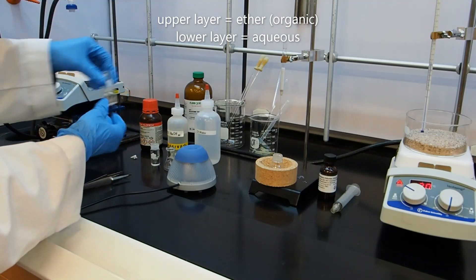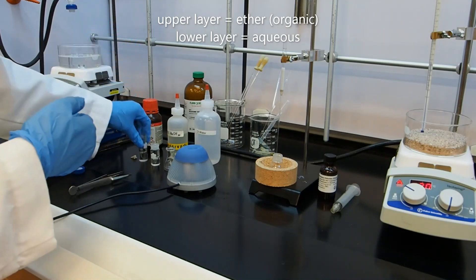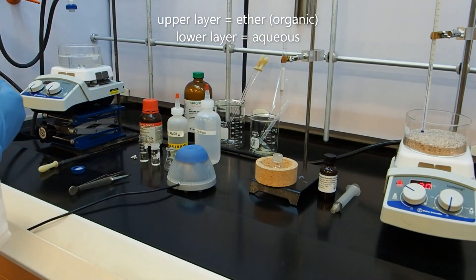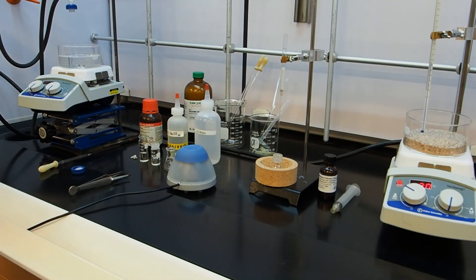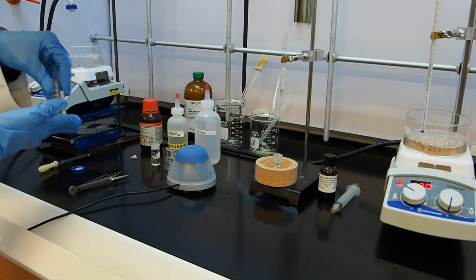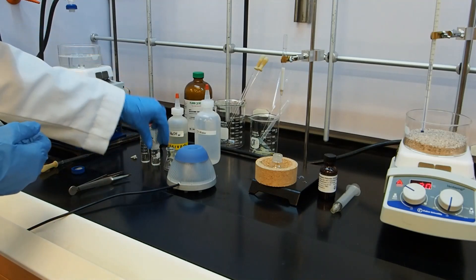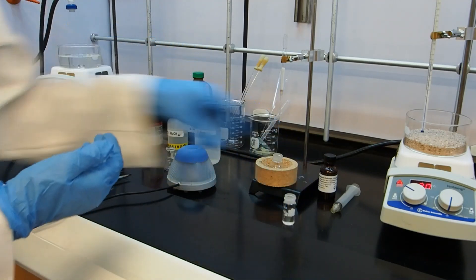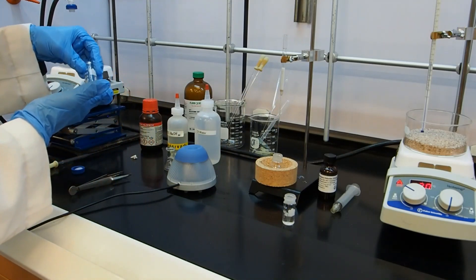So that was extraction with ether. I have water layer here, ether layer here. It's very important not to mix them up or to throw anything away before you've isolated your product. So the next thing we're going to do is we're going to add about 400 microliters of 5% sodium hydroxide to the ether layer. This is our water layer, we're setting that aside. This is my ether layer here.